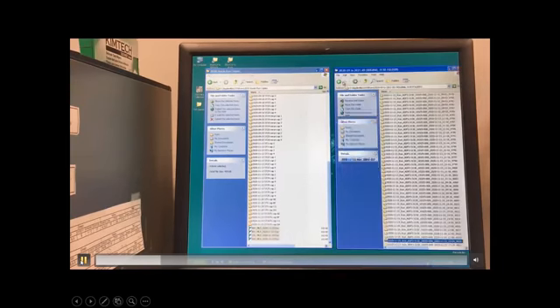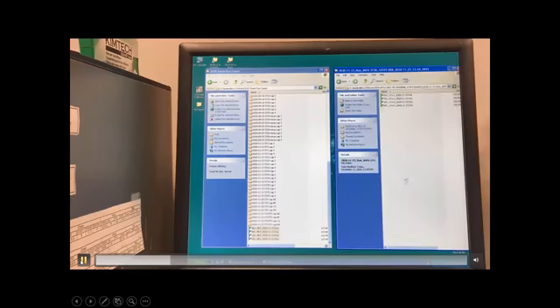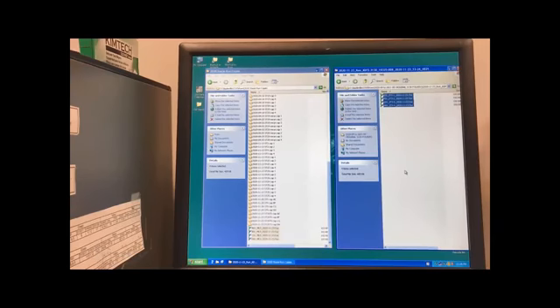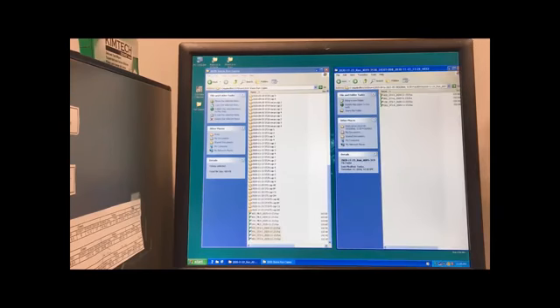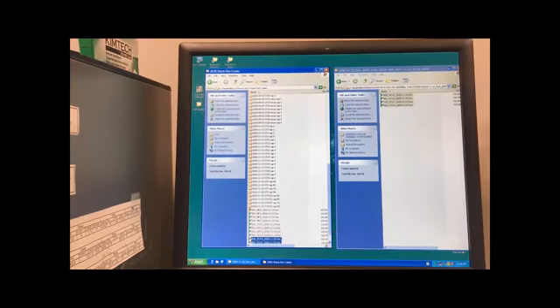Okay, now notice I'm still on that 1123 folder that I just did. So I just double clicked on the one right below it. Copy, paste. Look at how fast it's going. Go to the one below it. Control C, Control A to select all, Control C to copy, click over here, Control V, paste.